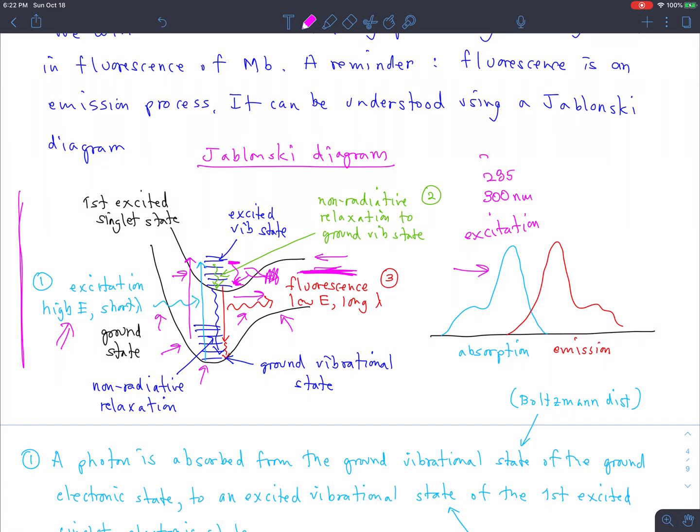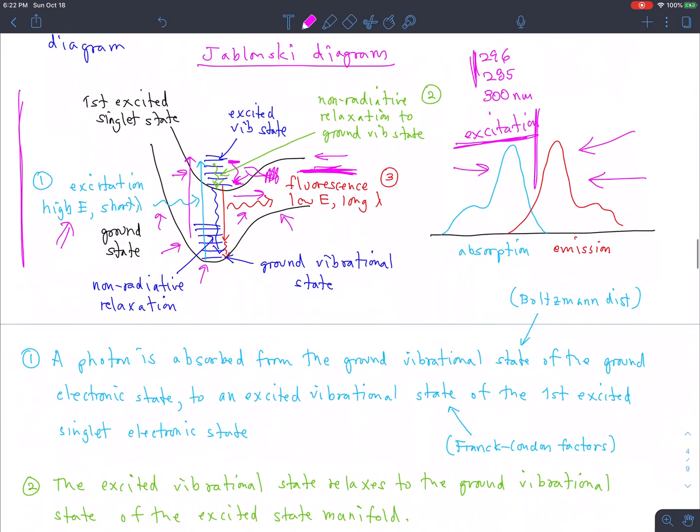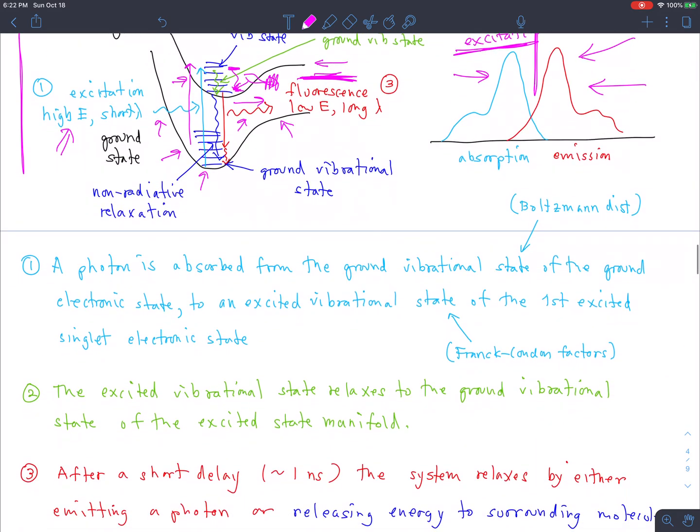285, 296, I think, is what the write-up says. And I don't think it matters a great deal what exactly the excitation energy is. It's got to be within the envelope of the absorber, which in this case are going to be tryptophans on the protein molecule. But then the emission comes out at a different and longer wavelength, which means you can put a filter in here, not see the excitation, only see the emission, and it looks like the molecule is glowing. For all intents and purposes, the molecule is glowing for us. All right, so that's how the fluorescence process works.